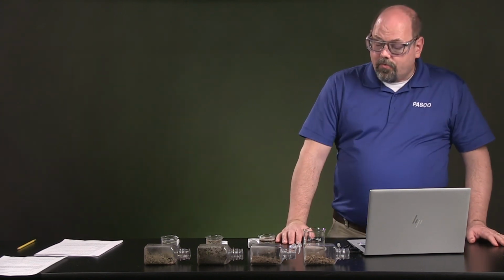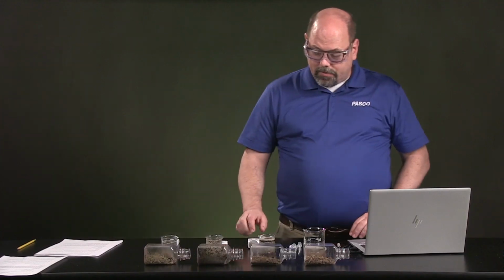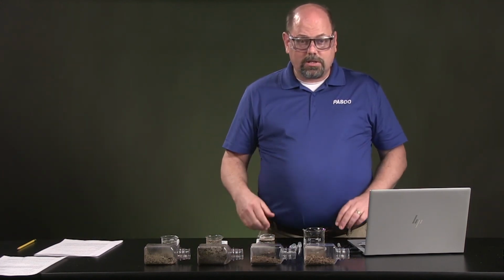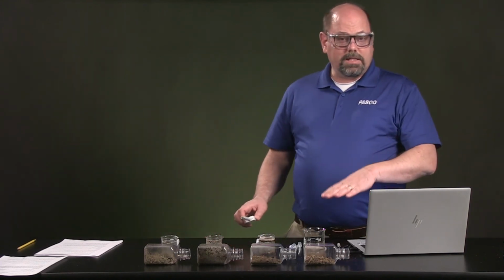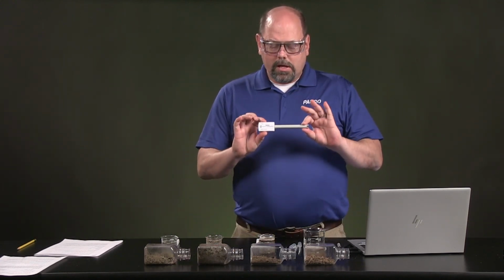So altogether, from the texture and the visible look at the soil, we can analyze where in the soil triangle that sample of soil is. We took a look at the biological activity with the carbon dioxide, and it's your job to do the analysis to see which of these is more biologically active, whether that's decomposers or small bugs that are doing the decomposition and active in that soil.